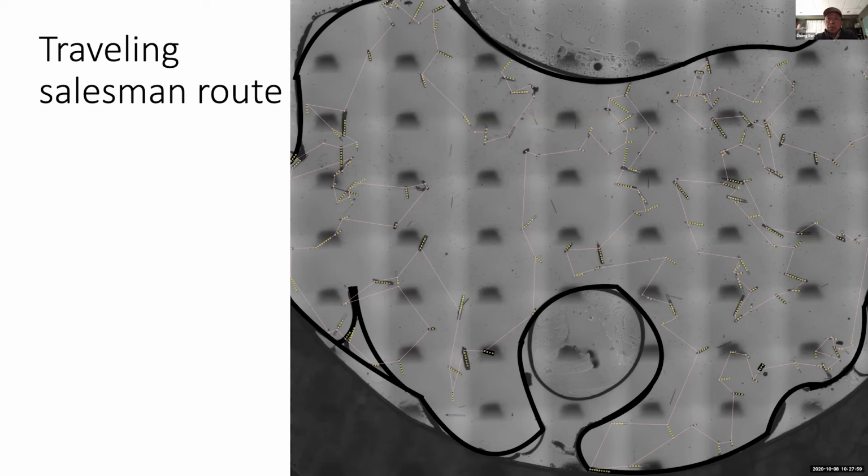But for some scientific reason, this may not be the optimal strategy. There are competing strategies. Say I want to rank the crystals from the best quality to the least quality, and then give priority to the best crystal at the beginning. That's another very sound strategy. But unfortunately, they cannot be combined. Well, maybe some users will find a way to combine them.